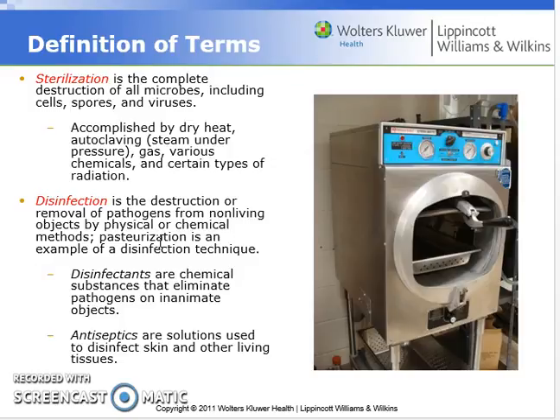If you're trying to kill a bacteria that contains endospores inside of an autoclave system, you essentially have to increase the temperature to higher than 121 degrees Celsius, and then increase the length of the autoclave time that's used in order to kill microorganisms.